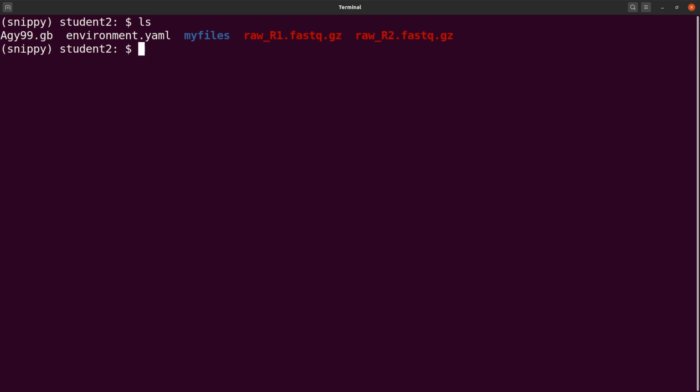It is also important to inspect your reads. Okay, so inspection can be done using tools like FastQC, MultiQC, etc. That is also part of the quality control. FastQC, for example, will do some analysis, generate plots and some visualizations that you can use to get to know the overall quality of your reads. So it is important you do this inspection. For this tutorial, I will skip the inspection aspect because I want to focus on the variant calling process itself.